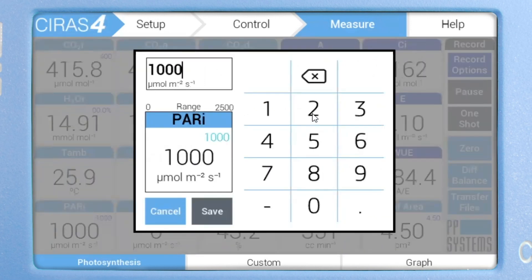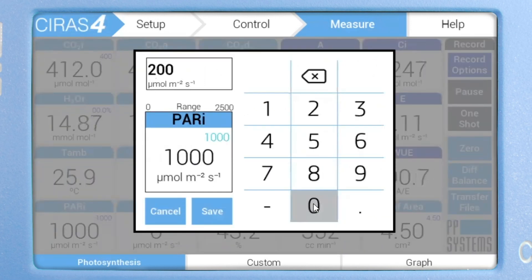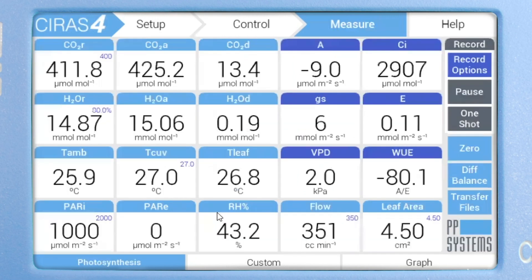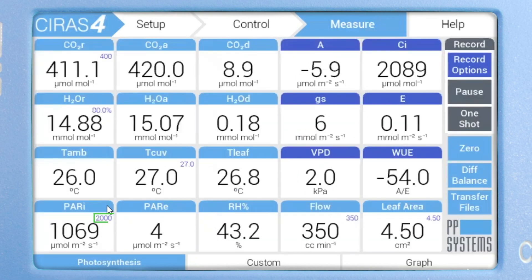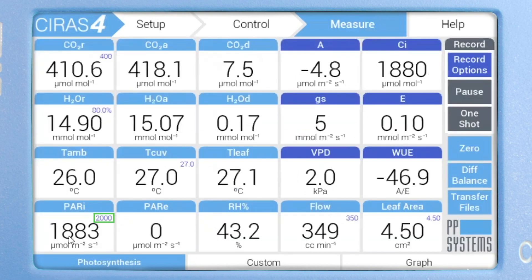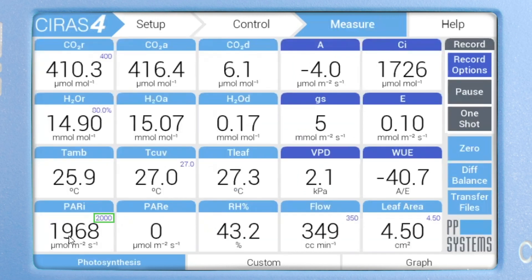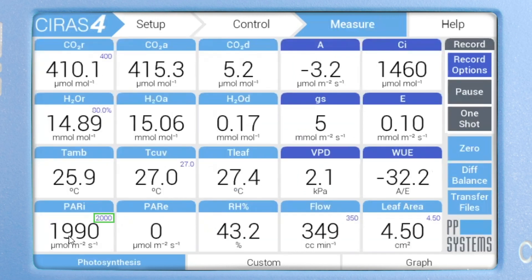Let's do the same for PAR and change the light intensity to 2000 micromoles per meter squared per second. Watch how quickly it achieves its new setpoint of 2000.